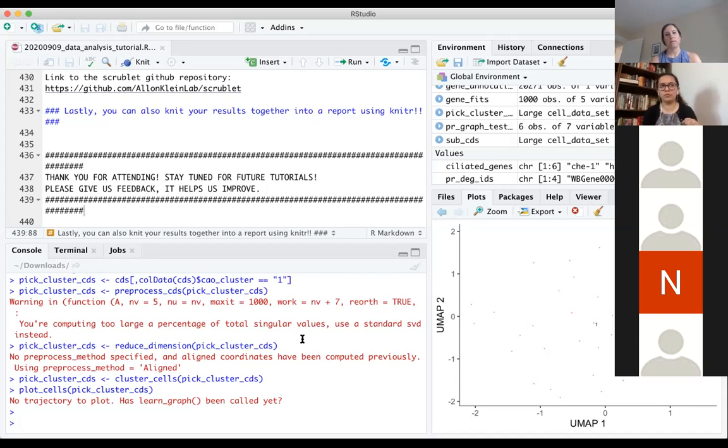Another way to test if your optimization is working is to subset out a part of your data and see if things very clearly change when you change the resolution parameter. If it doesn't, that means that the number of recovered nuclei is high, but the depth of the data is low. Yeah. Thank you.